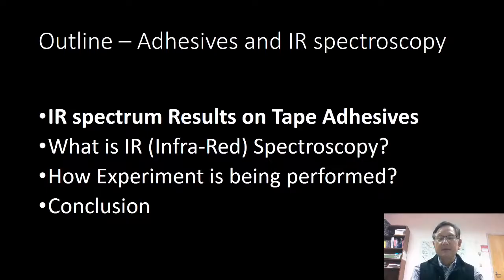IR. So what I'm going to talk to you about is the outline, which is our IR spectrum result on tape adhesives. Let me show you the result first, and then I will explain what IR spectroscopy means, and then show you how the experiment is performed in our lab, where my graduate students are helping me finish that. And I will show you the conclusion.